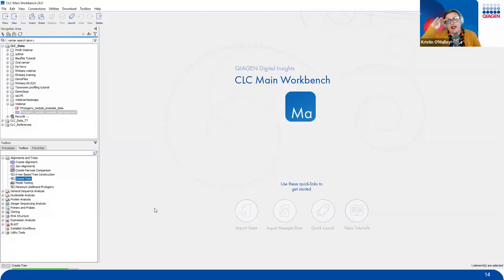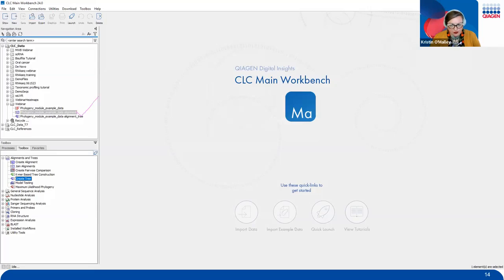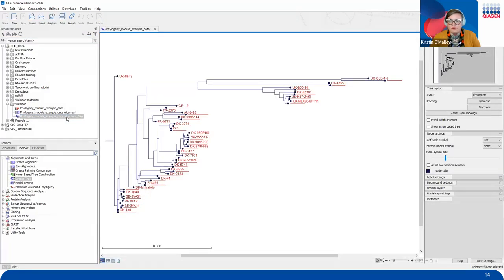This will quickly create a phylogenetic tree, and you can see it pop up rather quickly in our webinar folder here. But again, feel free to visit that Processes tab if you want to see what the status is for the tree construction. So let's go ahead and visit our webinar folder and double click on our alignment tree data here. So we're going to go ahead and double click on that, and it's going to open up our tree.